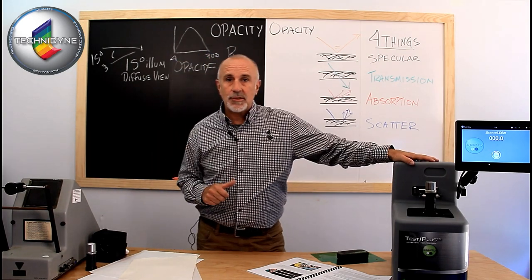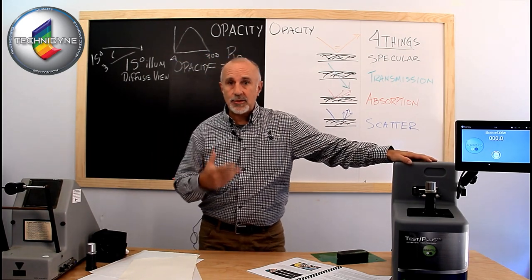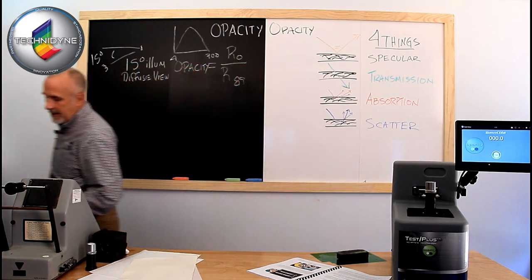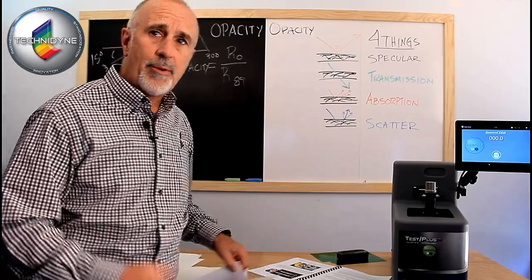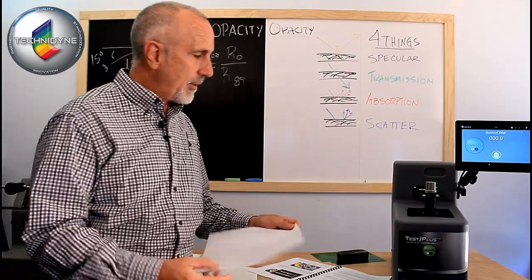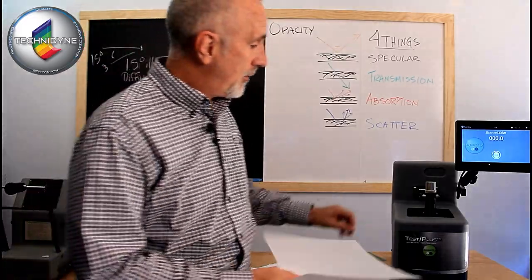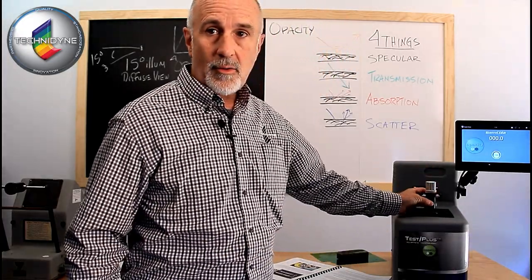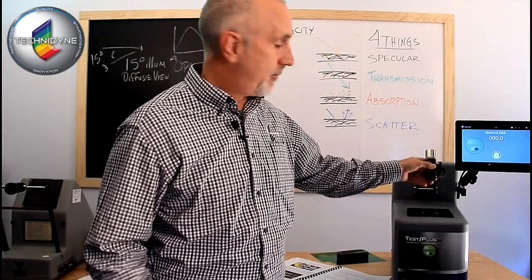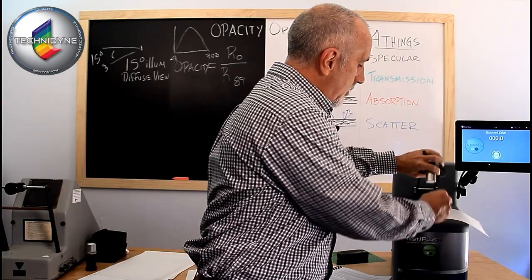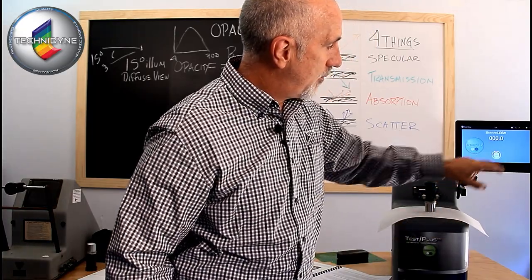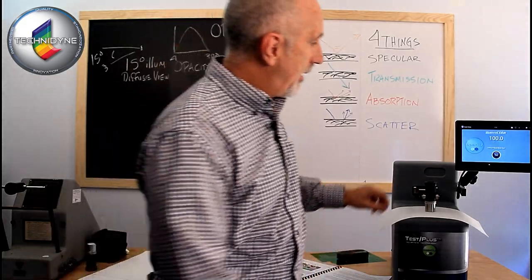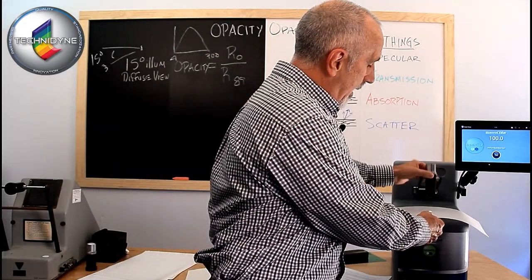But to wrap up this section on TAPPI opacity, let's just look at a couple measurements real quick. Now we had viewed some of these samples up on the board originally, and so if I load this onto the instrument, and I've got my white backing, black backing here, so I'm going to load that. The software instructs me to load the white body, so I'm going to test that, and then after it does that, it says now load the black body.